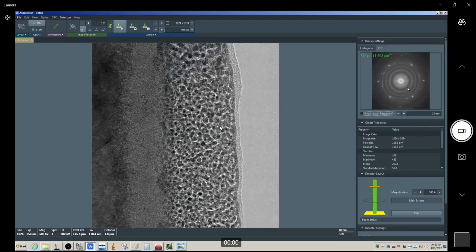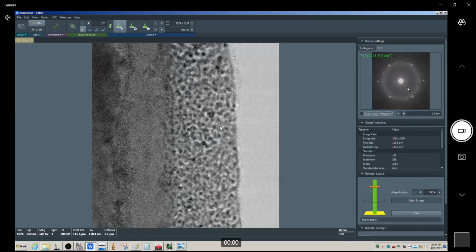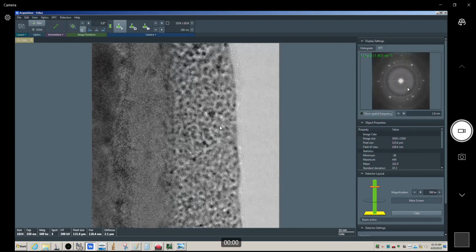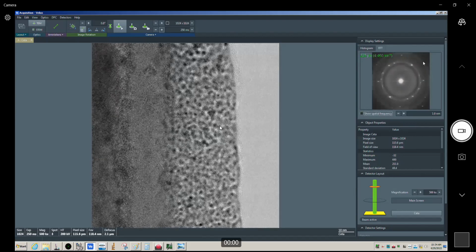All right, so now let me get it to an over focus condition. If I want to get to an over focus condition, I have to go clockwise with the focus knob until I see that dark ring come back again. Okay, so now I'm in an over focus condition. I can tell that also by looking at the picture. But if I wasn't sure, again, I could diagnose what's happening based on this first dark ring here. If it expands when I go counterclockwise, I'm over focused.